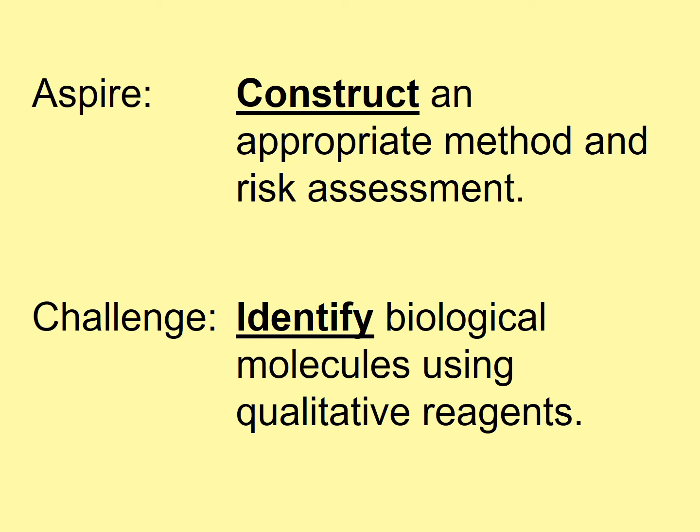These are the challenge and aspire. The challenge is to identify biological molecules, those nutrients, using these reagents, and the aspire is being able to write the method and a risk assessment. When we do an experiment, beforehand we write a risk assessment to cover all the risks that could happen in the experiment and how we can control them, so we stop any accidents happening. As teachers, we write those risk assessments.